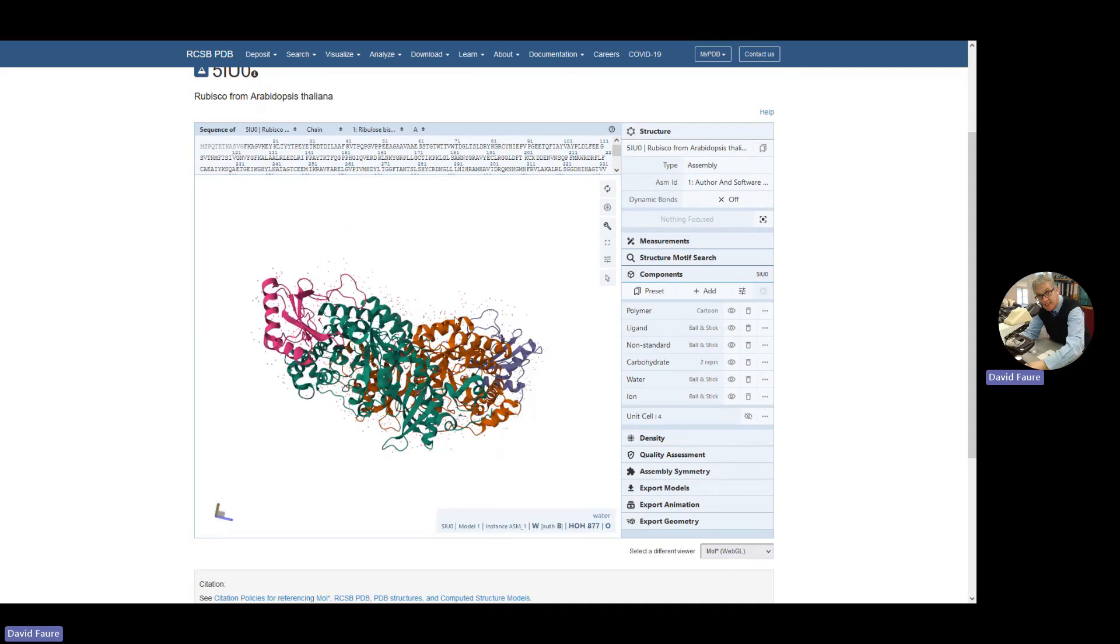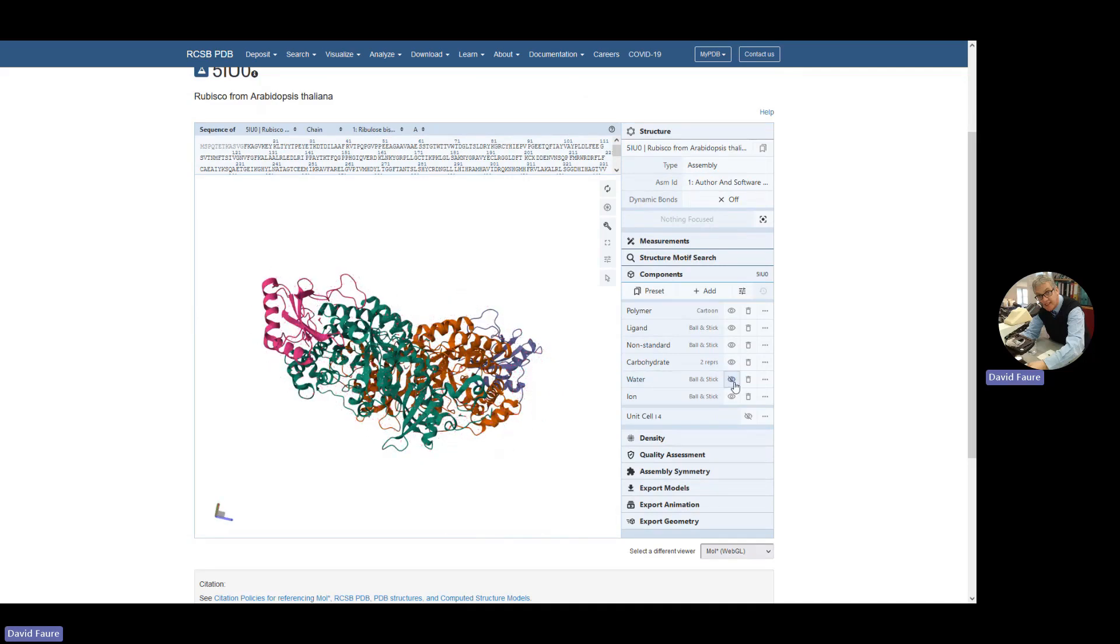The little pink dots represent water molecules. We can remove the water molecules if we want, just by clicking the components, clicking little I.